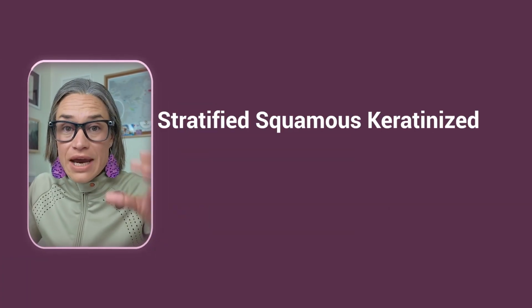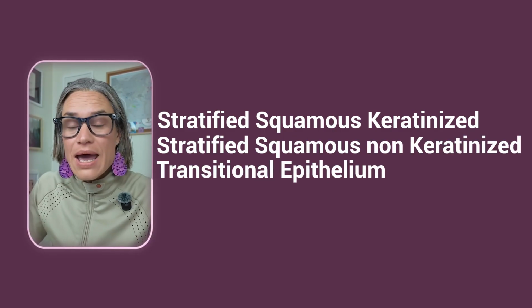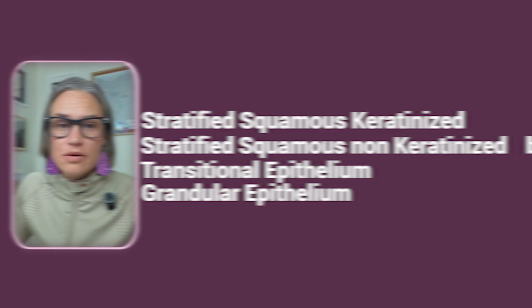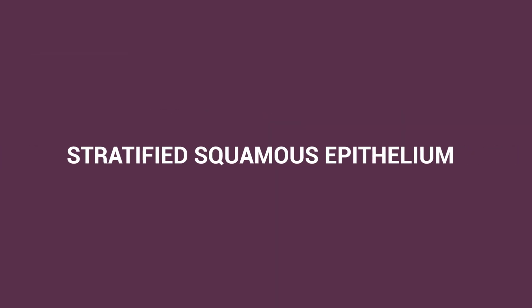Today we're gonna cover the more complex epithelia. Last time it was simple epithelium, and today we're gonna cover stratified squamous keratinized, stratified squamous non-keratinized, transitional epithelium, and glandular epithelium. So let's have a look at stratified squamous epithelium.